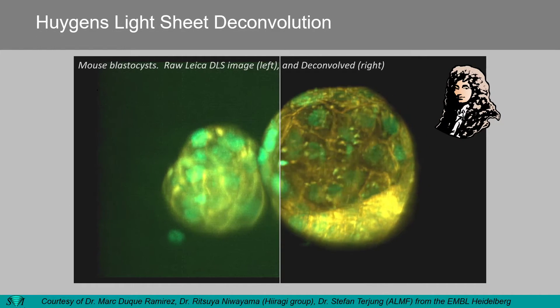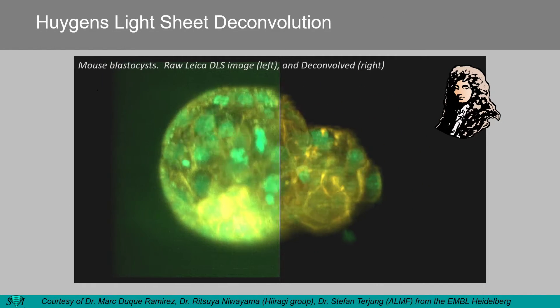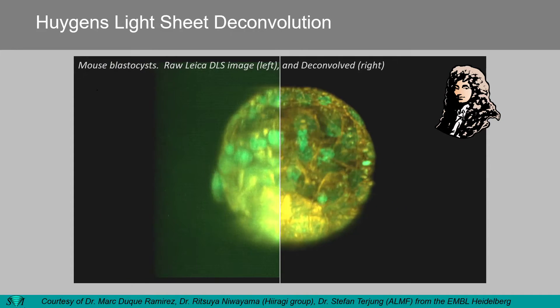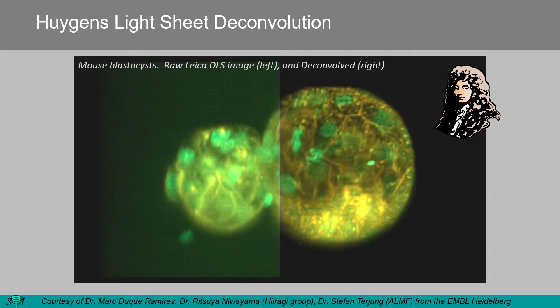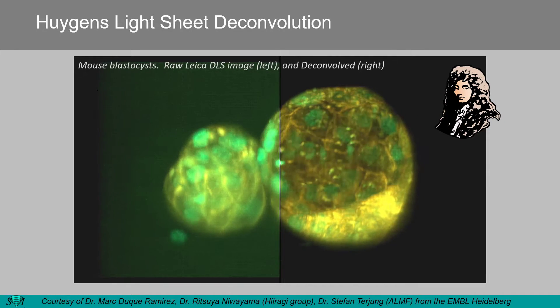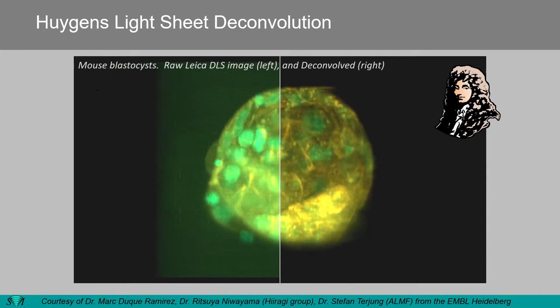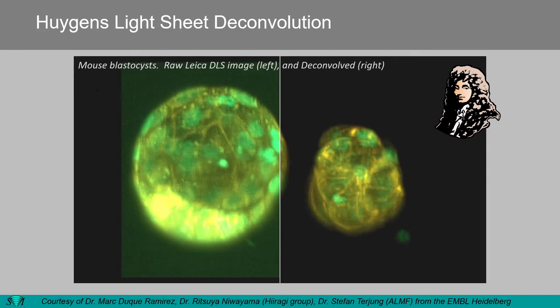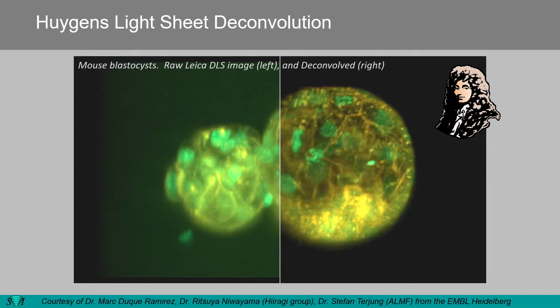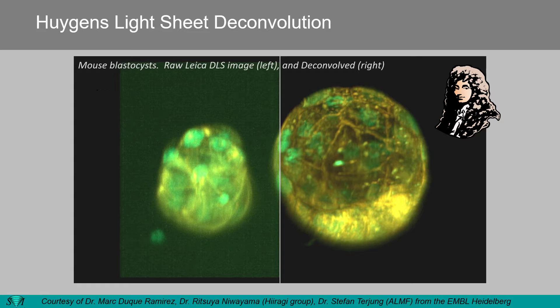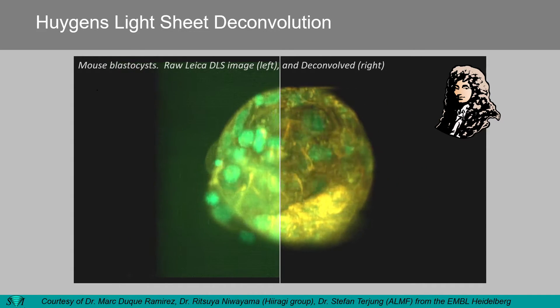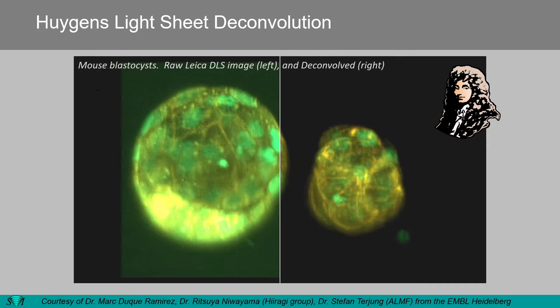This shows the effect of deconvolving a mouse blastocyst image. The movie is a rotating maximum intensity projection, where the left part shows the original image and the right part shows it after deconvolution. The deconvolved image on the right shows that the background is removed, the contrast is improved, and more details are visible.